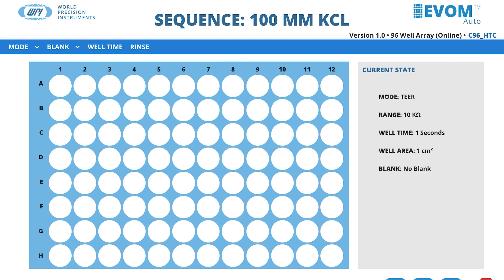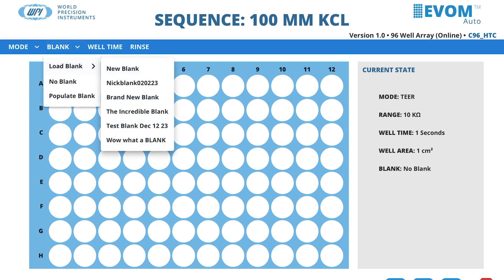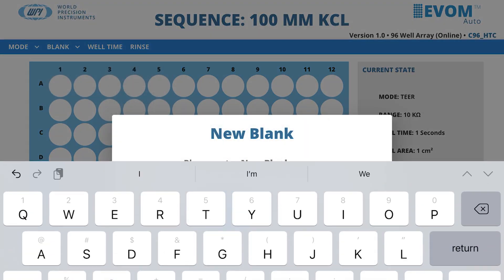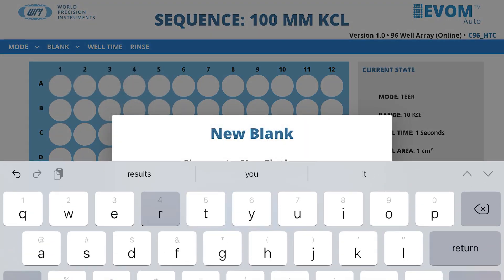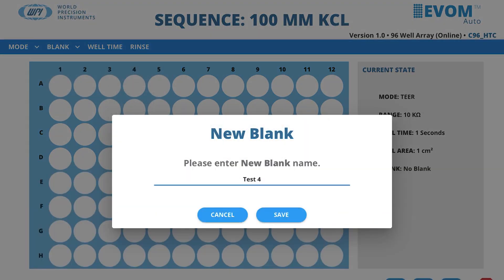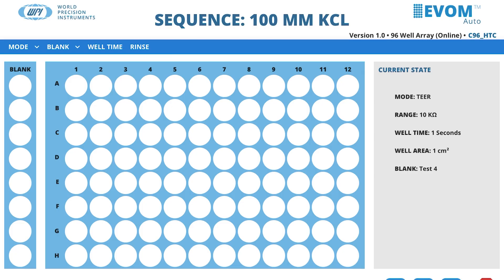To start the blank setup, select the Blank menu and choose Load Blank, and then New Blank to create a container for the blank baseline data. Once the sequence is saved, the container is created with a default value of zero shown.